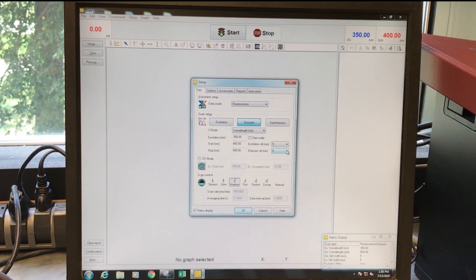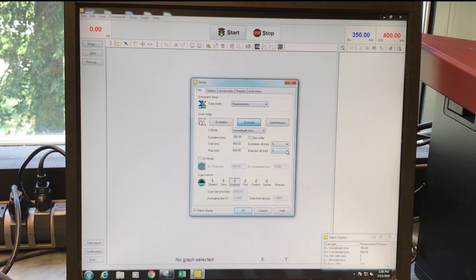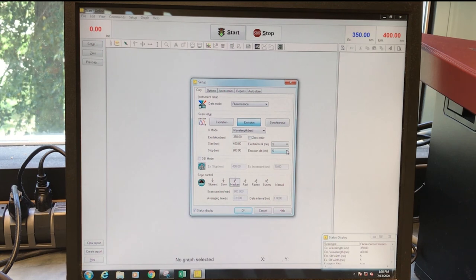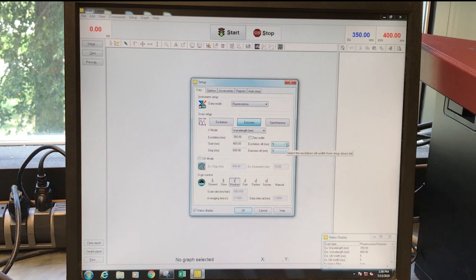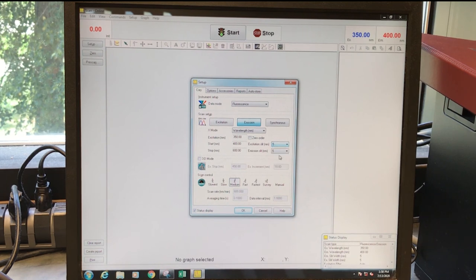On the other hand, if you're having trouble obtaining a spectrum, maybe there's not enough light reaching the sample, you can make these slits larger or things like that.